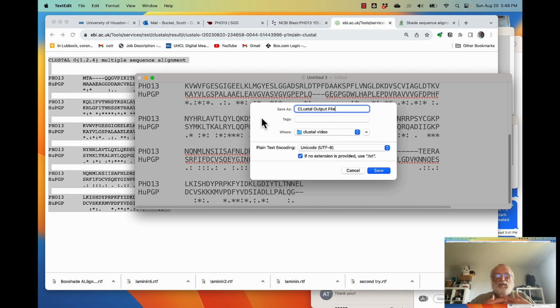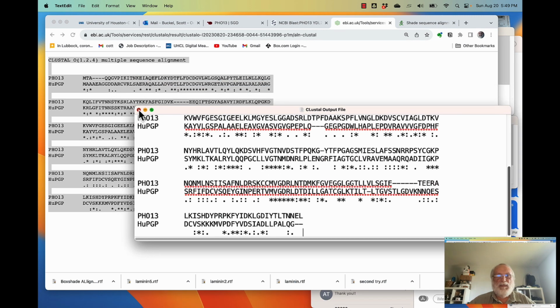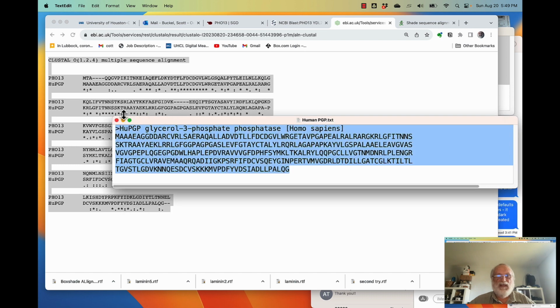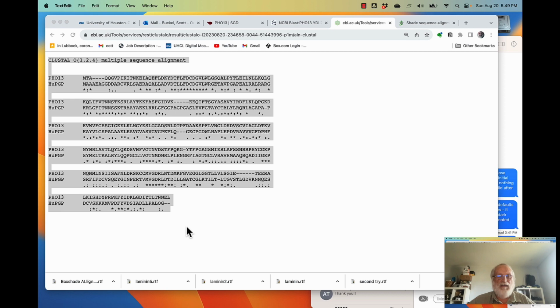While I'm doing this, I create one folder, and every search has all the different files in it, so that if something didn't work, or I see something odd, or I find that maybe I had the wrong sequence, I can go through and make some minor changes and figure it out. Just go ahead and hit save. But the key here, the first step along this process, is to go ahead and generate this Clustal file.